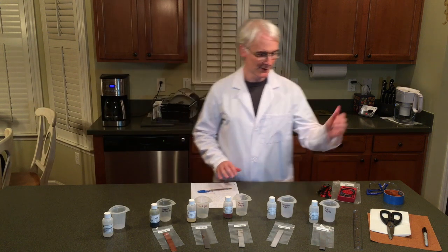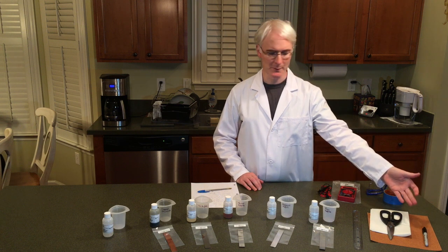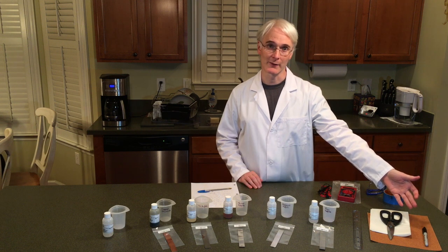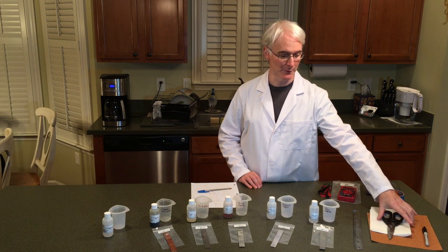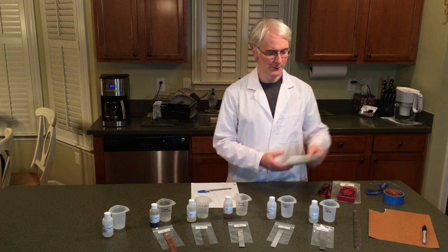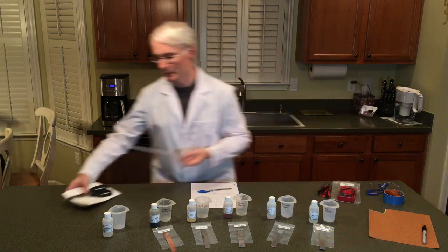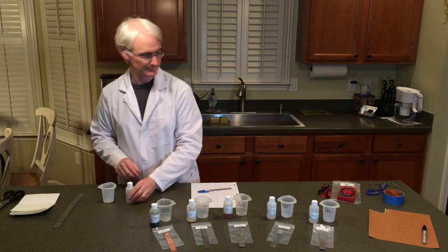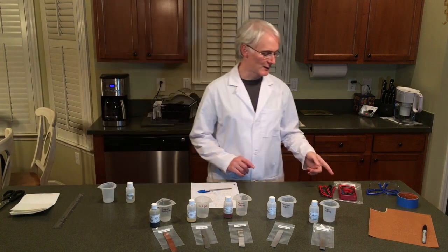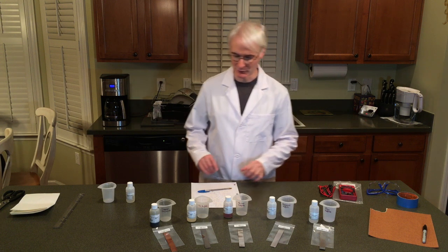Over here we have our supplies: sandpaper, a permanent marker — you'll need that to mark the containers — scissors, and quite a lot of filter paper. We also have our ruler. And over here we have our digital multimeter, which we will come to in a few moments.